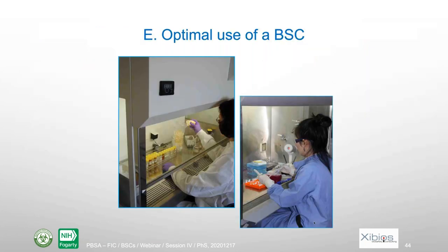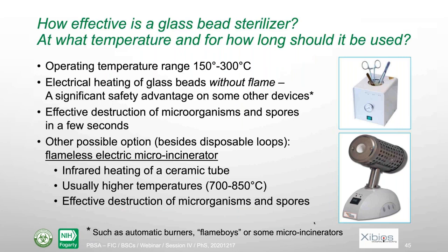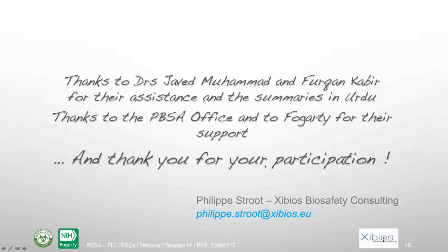So with respect to the normal use of biosafety cabinet, there was just one question. It was about the glass bead sterilizers, and we answered that question during the session. I mean, Furqan did it. Just one thing that I forgot to tell you about the flameless electric microincinerator, which is what is represented in the bottom picture there. It's flameless, so there are no flames, so it's safer.